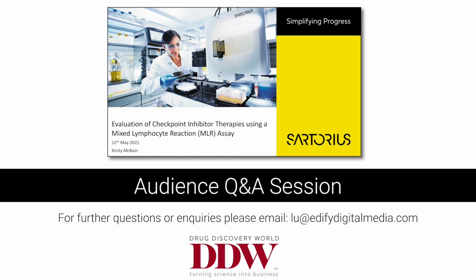Another question here: what are the advantages or disadvantages of using one-way compared to two-way MLR? The main advantage of the one-way model is that you get simple unidirectional activation of the T cells without much background signal, which would be the main disadvantage of the two-way model, as this gives a more crude measurement of the activation and cytokine release due to the presence of multiple cell types from each donor. The disadvantage of the one-way MLR is that it requires isolated immune cell populations, which is generally going to be either more time-consuming or more expensive to acquire compared to straight PBMC samples that are required for the two-way MLR.